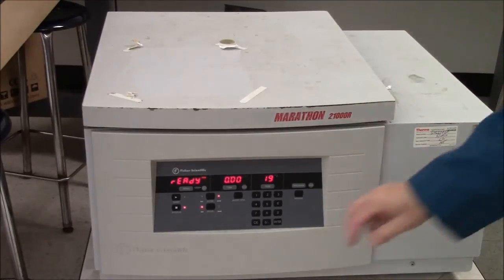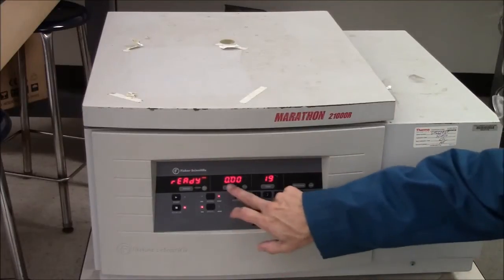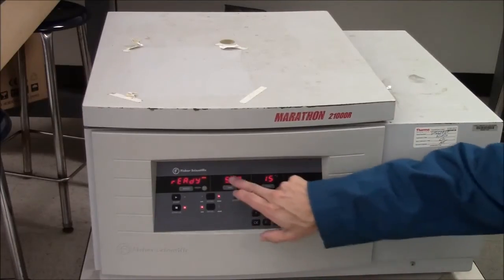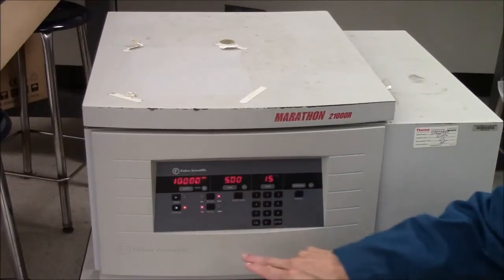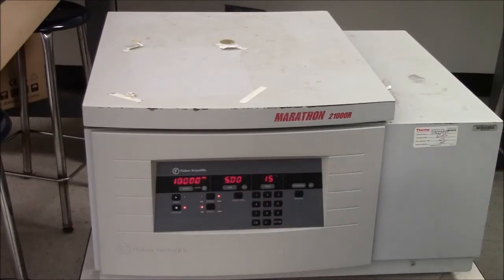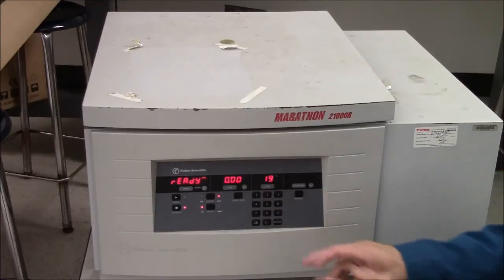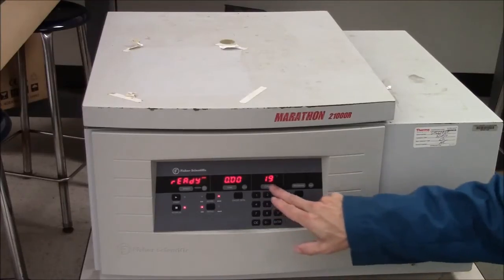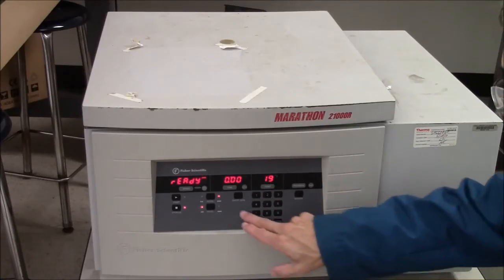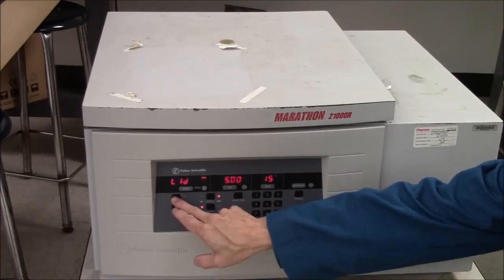And it has a big lid for the entire machine. So now I'll set the conditions for the spin. Time: five minutes. Speed: 10,000 RPMs. I could set a temperature. It's a refrigerated centrifuge. In this case, there's not any need for it to be refrigerated. Press the start button.